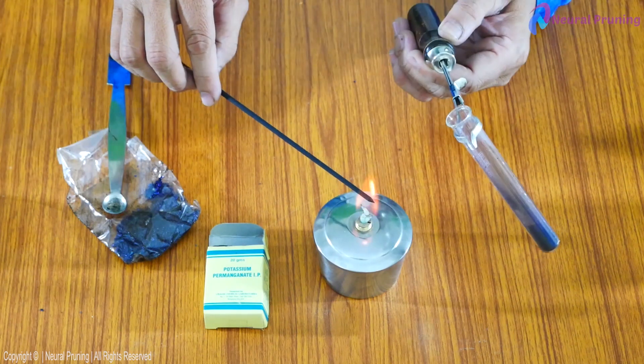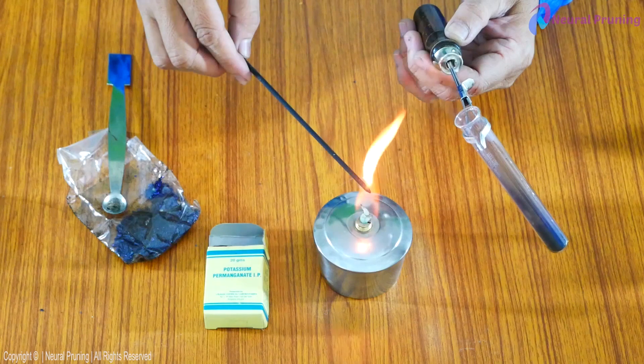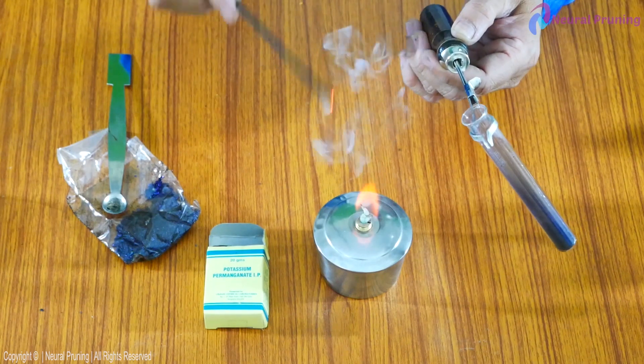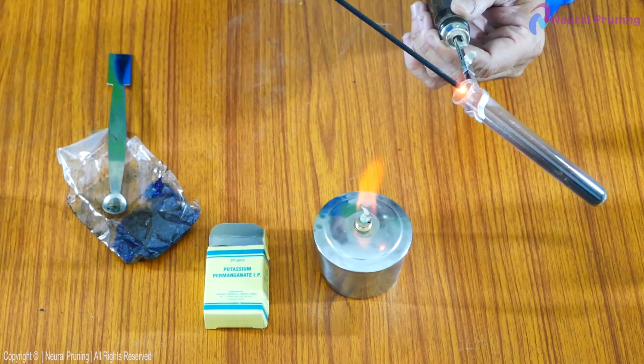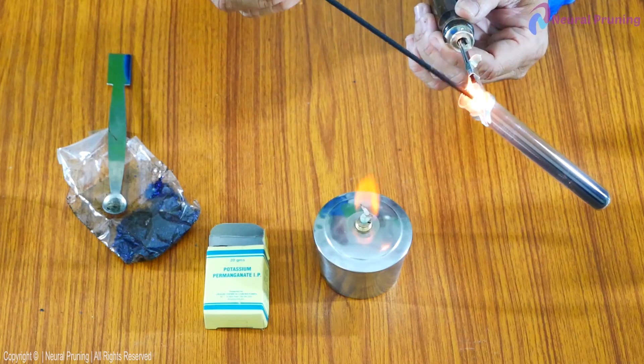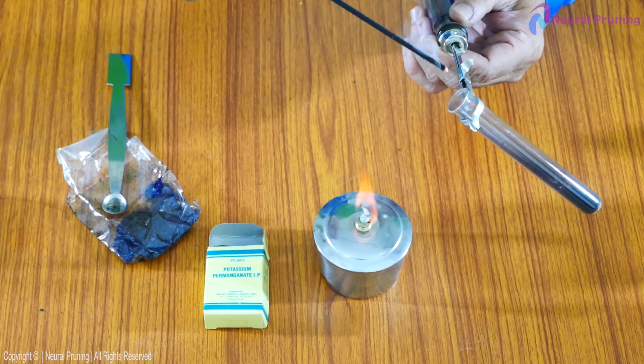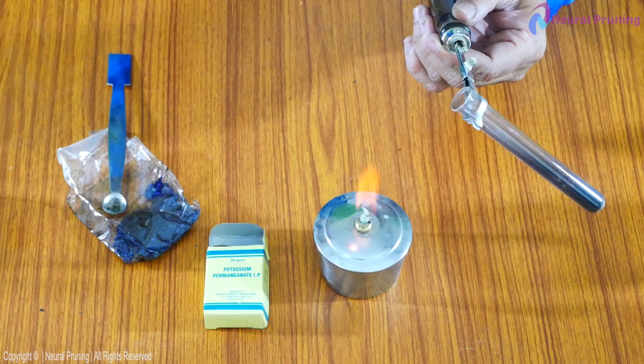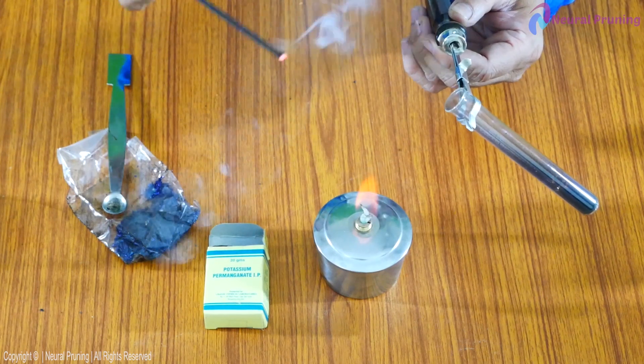Now, observe, I am bringing a burning splinter or this incense stick to the mouth of test tube. What you are observing? This indicates oxygen is released during the decomposition of potassium permanganate.